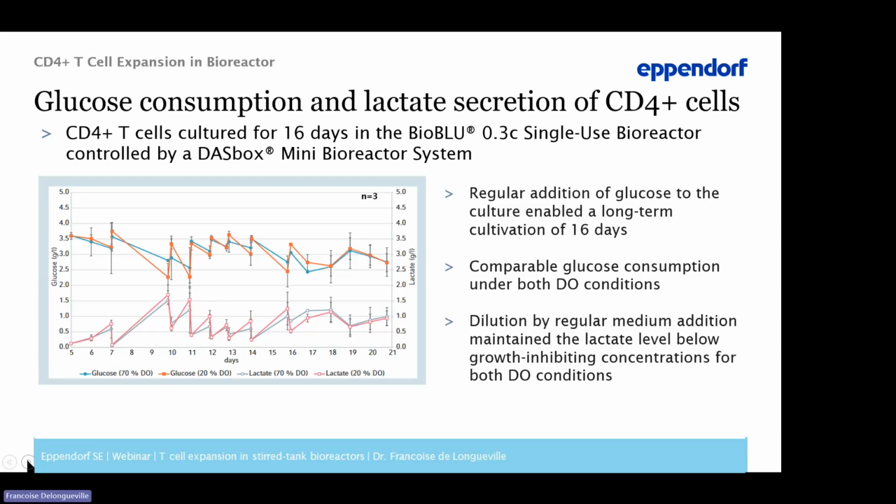affect cell metabolism. Additionally, lactate production was monitored at each dilution point. As expected, lactate level increased as the available glucose in the culture was consumed. As previously observed, the cell density adjustment reduced fluctuation of lactate level during the culture process. The fine control of those parameters is essential to maintain cells in a robust state and improve their proliferation.